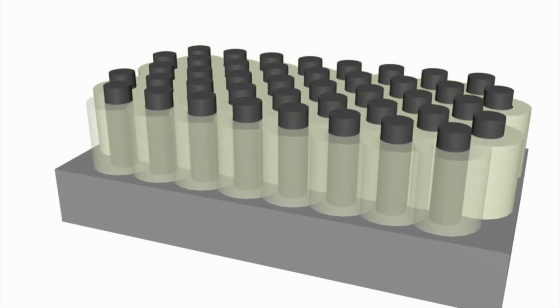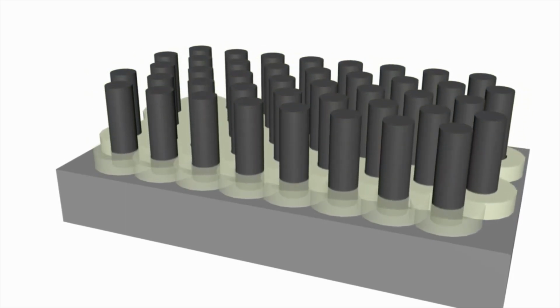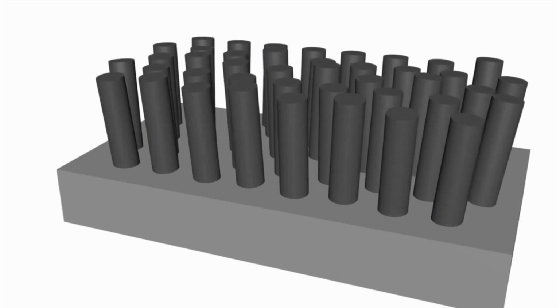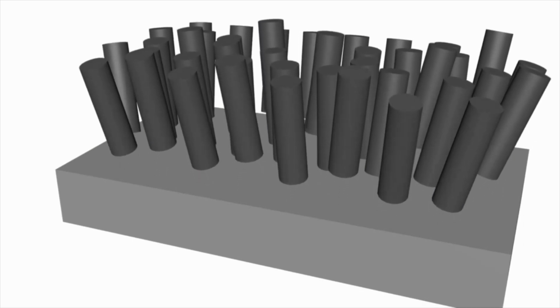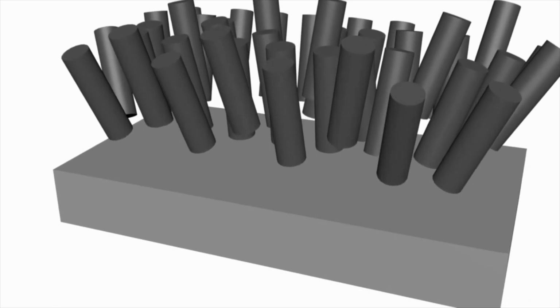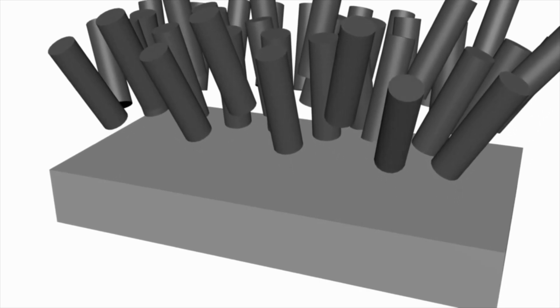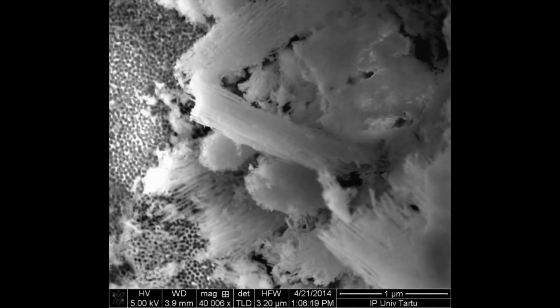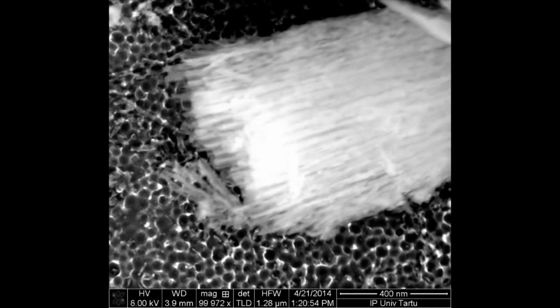The surrounding aluminum oxide can be easily removed by simple etching in sodium hydroxide, allowing the nanorods to escape into the solution. The length of the current nanowires is several micrometers and diameter around 20 nanometers. They may be clustered at start, but can easily be separated by additional treatments.